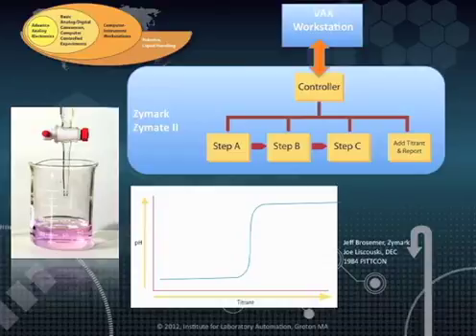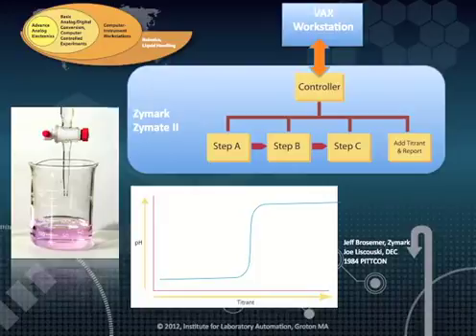The computer system would get the results of each liquid addition and calculate the next addition, repeating the steps until a titration was completed. This allowed the analyst to see the development of the titration curve as the experiment progressed, something not normally seen when robots carry it out. In addition, the speed of the analysis was increased because larger amounts of liquid could be added where changes were very small, and smaller amounts added where changes were large.